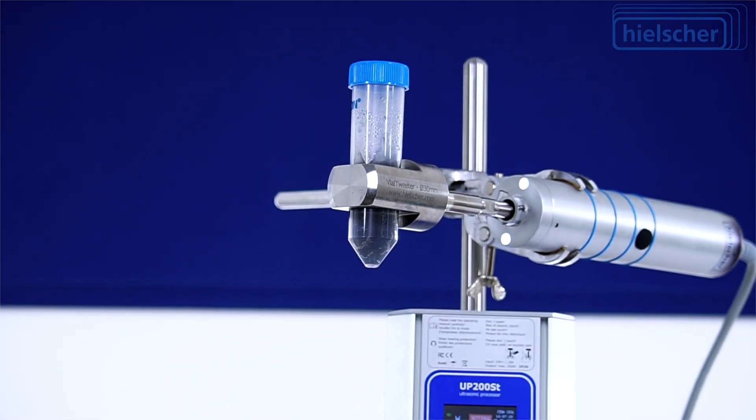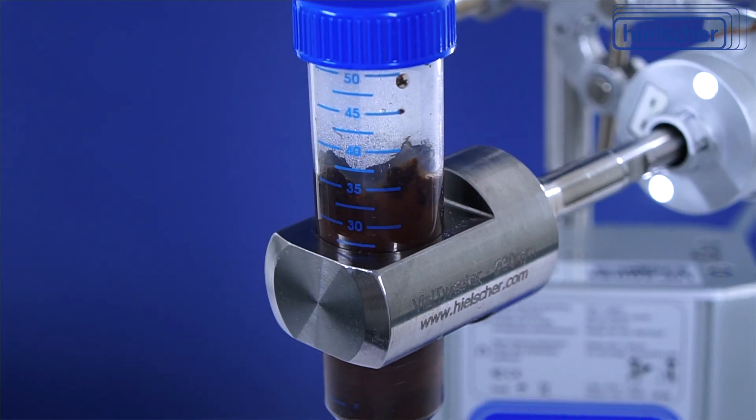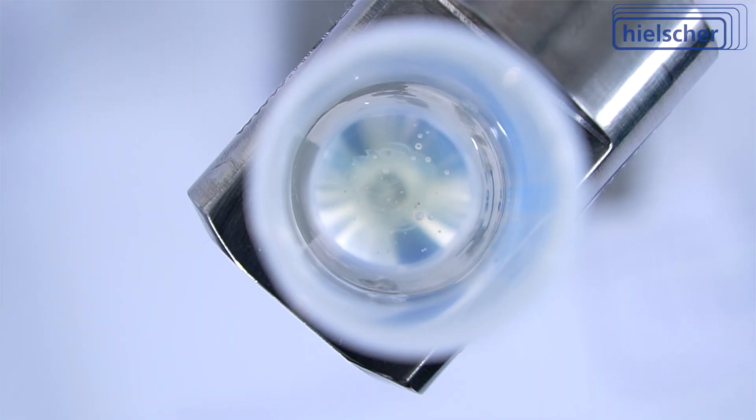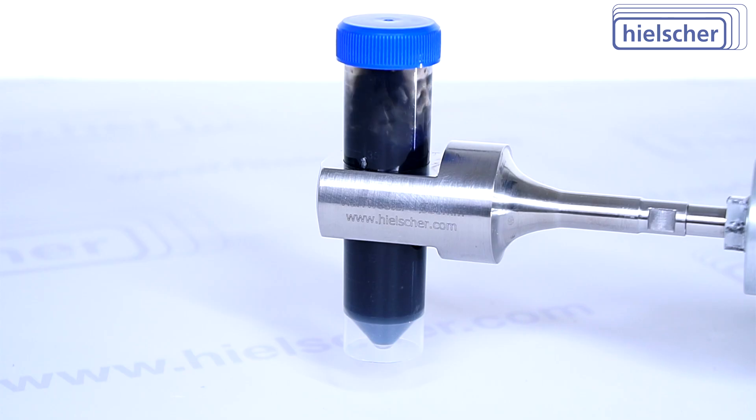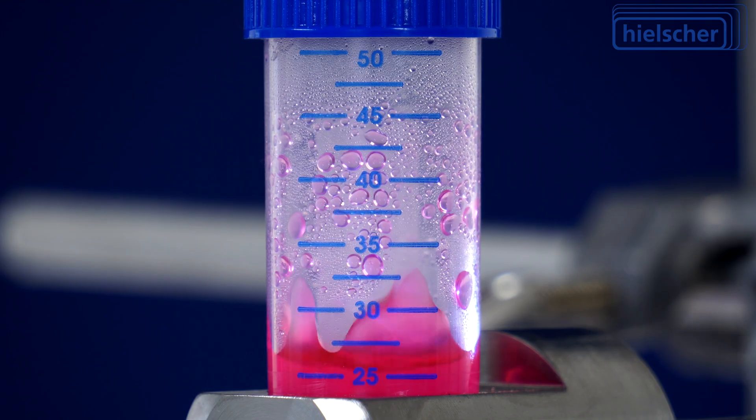In a 50 milliliter falcon tube, you can achieve powerful cell lysis, create stable emulsions, and disperse nanoparticles, all thanks to the Hielscher Vial Tweeter.